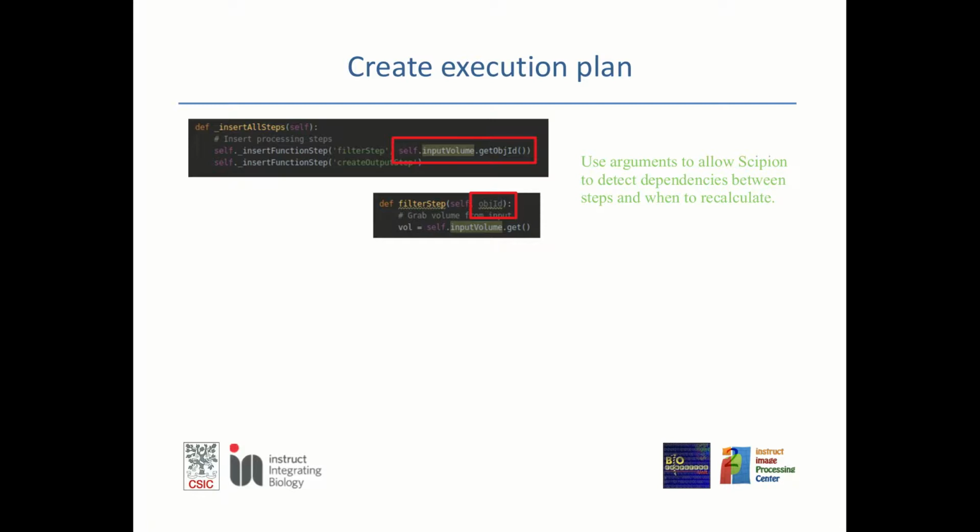If you rerun the protocol, some of the steps may not need to be re-executed because they will give the same result as before, but you have changed this parameter, and then from this parameter all these steps would change. So here we could put all the parameters that are related to the filtering.